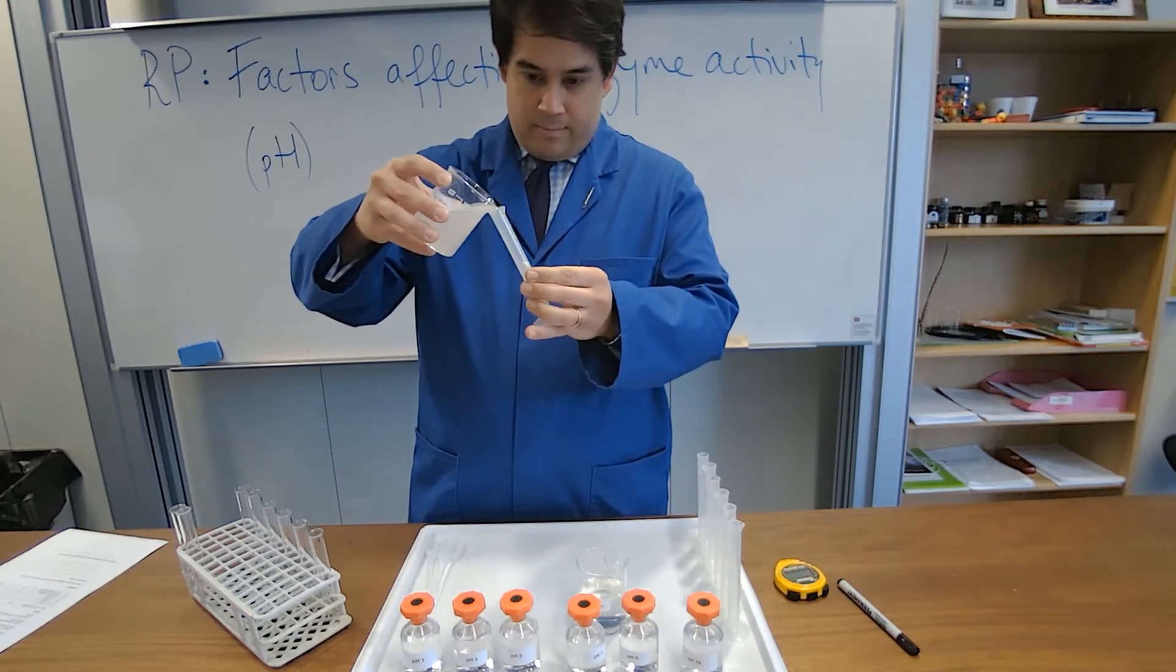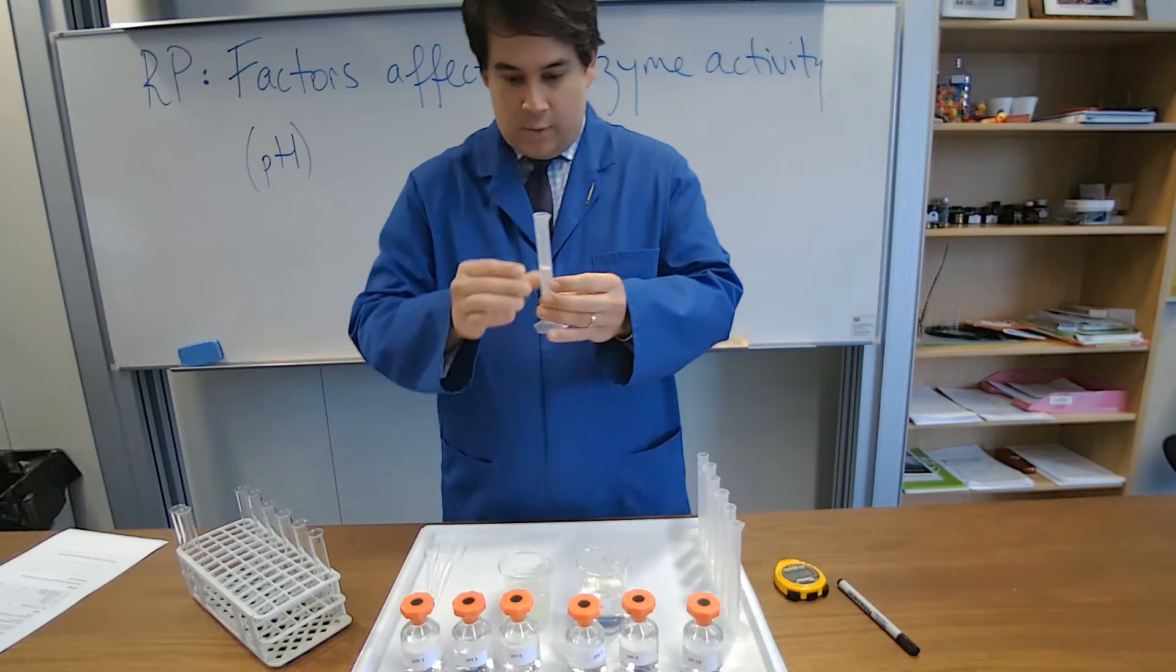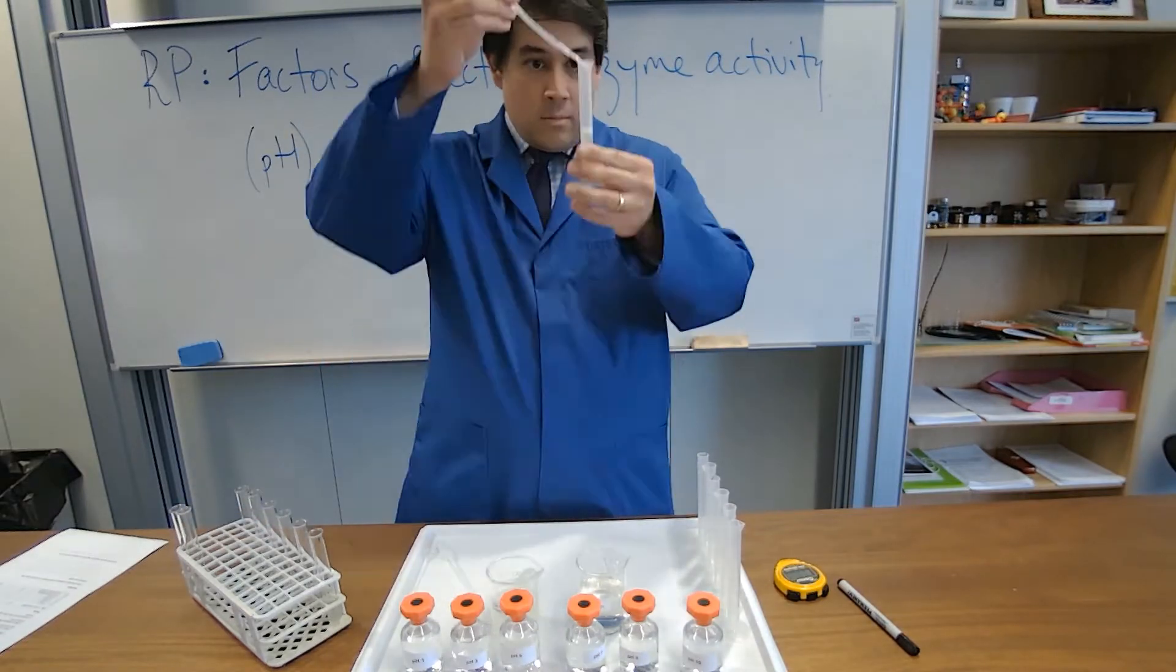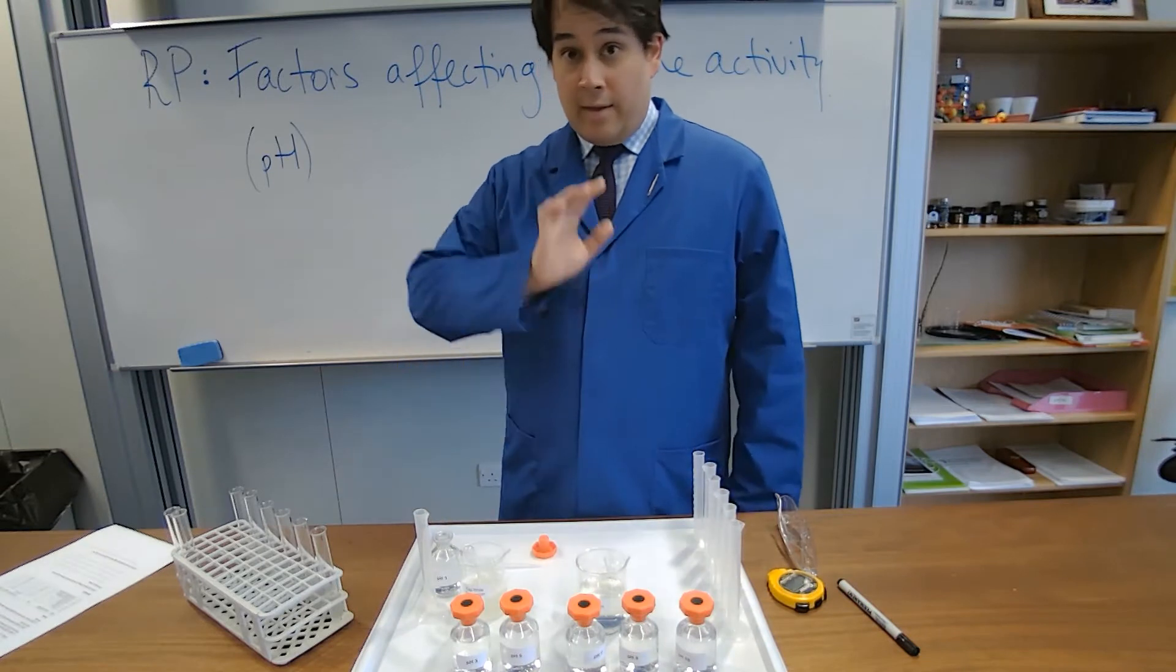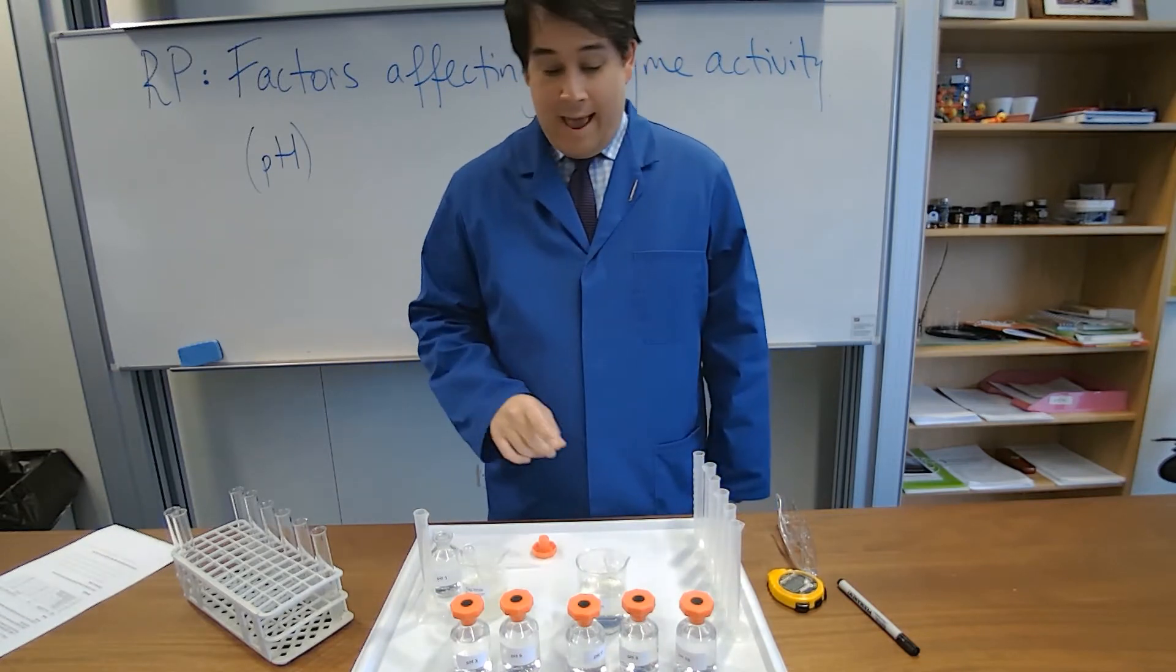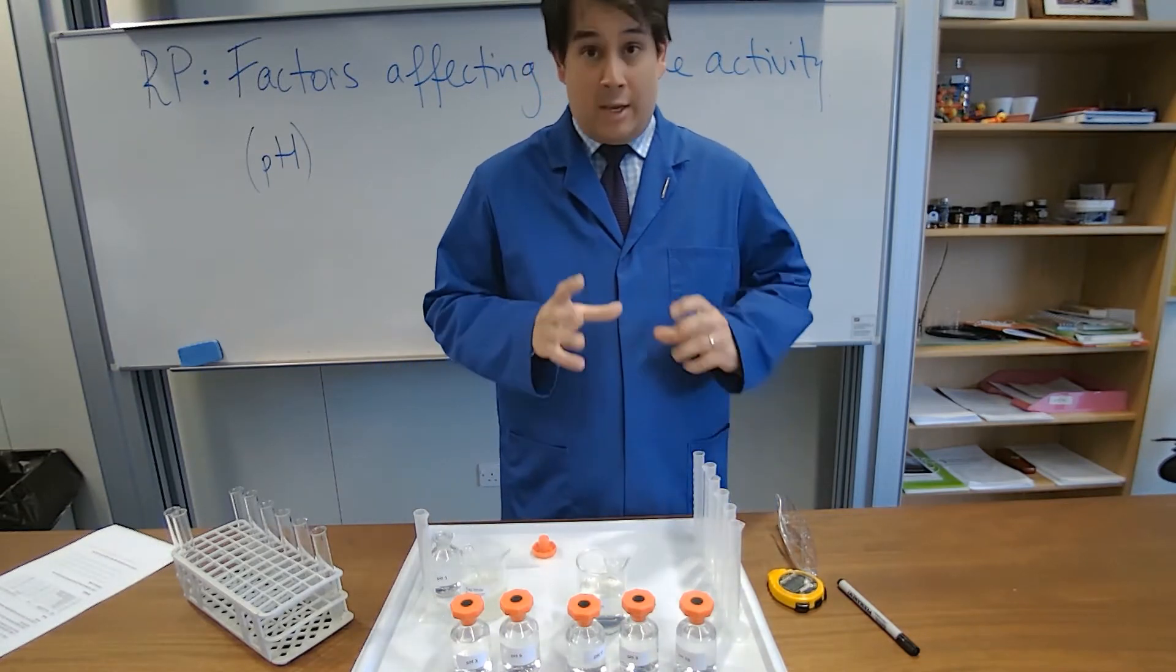We're going to have five ml of albumin to each one. Now that that is done, we're now going to add some of our buffers, which is pH buffers.